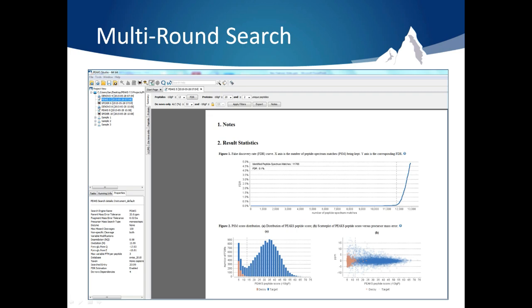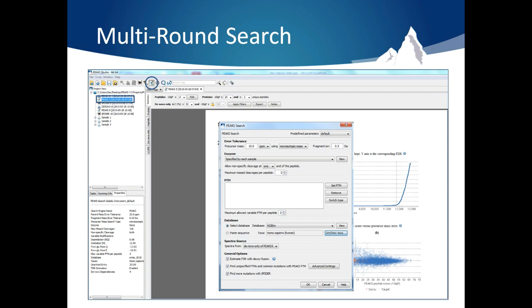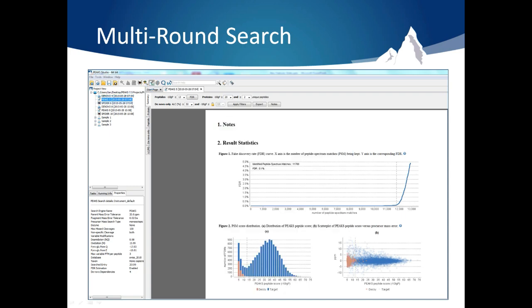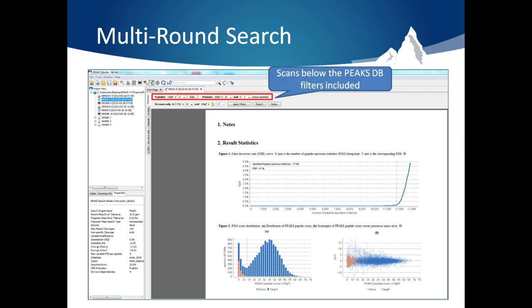To actually set up a Multi-Round Search, all you have to do is select an existing database search result and click the Multi-Round Search button. This will bring up a new search parameters pane where you can select any new parameters you wish to search the de novo only results with. Keep in mind, the de novo only results are controlled by the filters you set in the summary view of the initial search. Scans with identification results below the database search filters and above the de novo ALC filters will be included in the de novo only results. So, check to make sure you are satisfied with those settings before starting your Multi-Round Search.